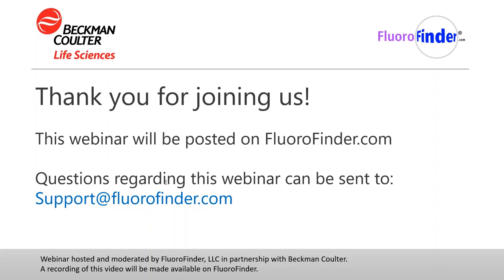Great. Maybe the last question that I have received so far is from Mariana, asking, did you try this approach with cryopreserved blood? So we've not been using cryopreserved blood, at least not for this assay. What we've been doing, and this is really in the context of multicentric studies, we've been looking really carefully at the post-staining stability of samples post-activation.